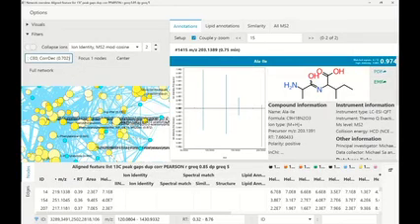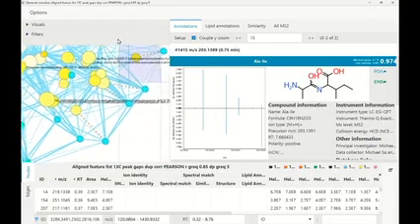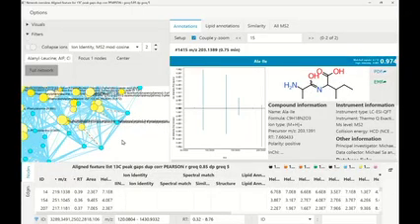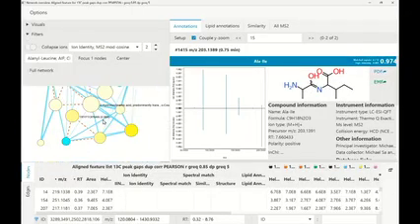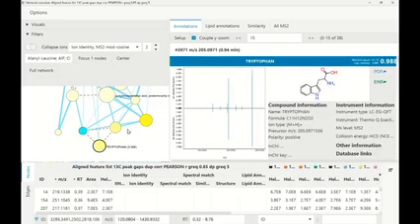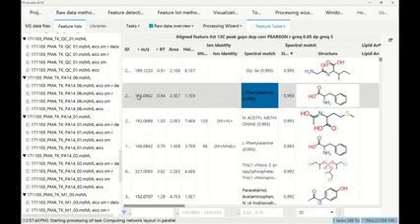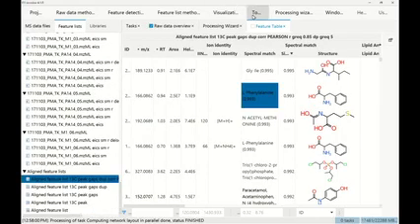So yeah, in the networks, the first thing that we can see is this is quite a busy network. Maybe I can also find something more like a smaller network. Okay, yeah, so just again, if you want to open the molecular networks, I did it this way.